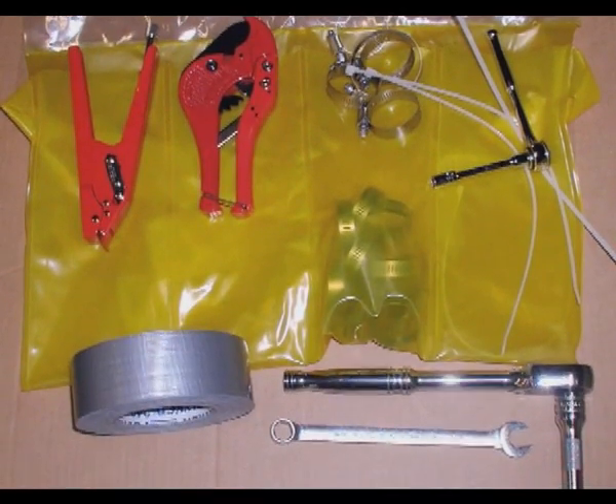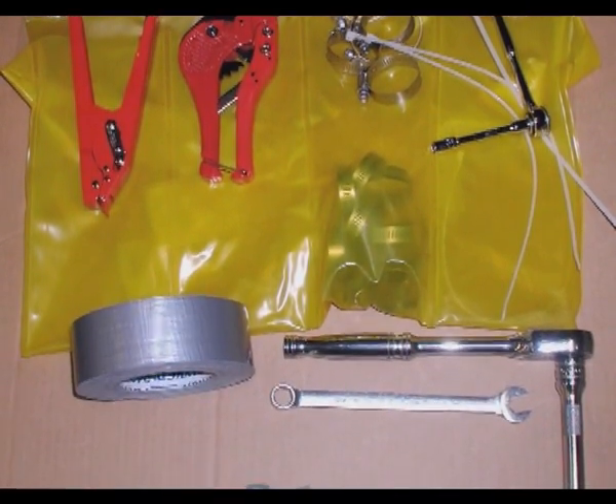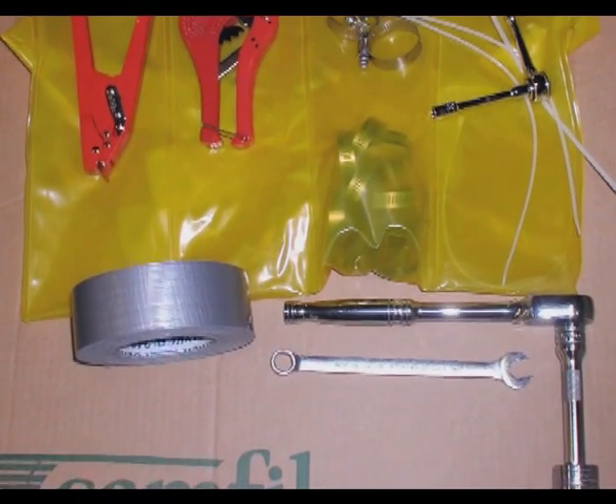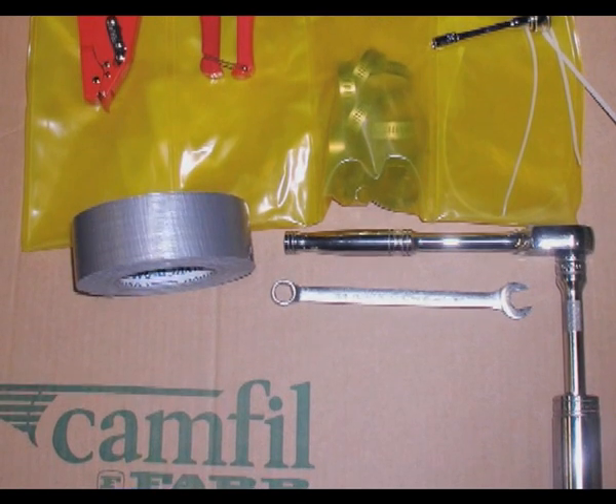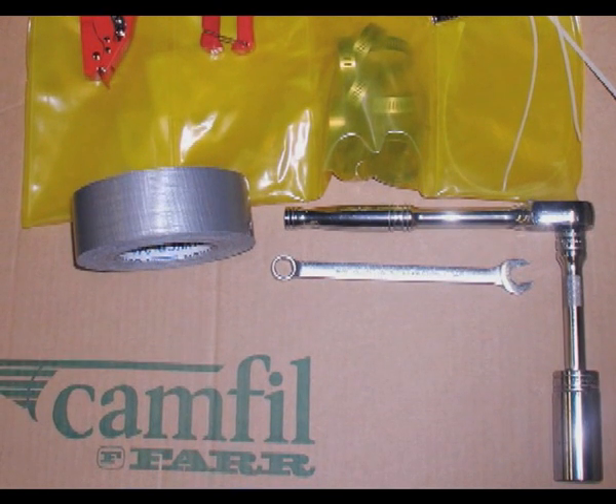You will need a ratchet with extension and an 11/16 inch socket. A banding kit, available through Camfil Far, can assist in the change out of the filter and will be shown in this demonstration video. The twist and tape method can also be used and will be described in this video.